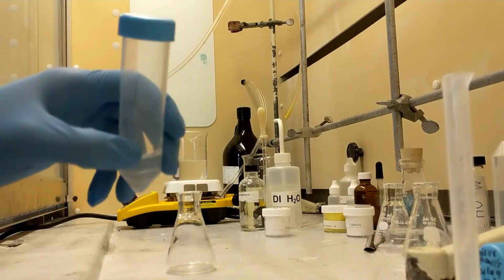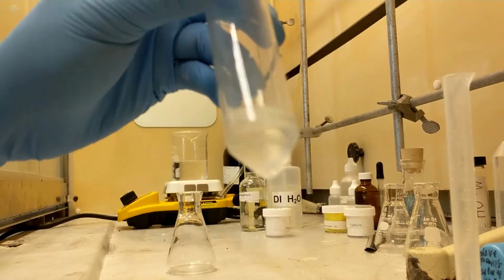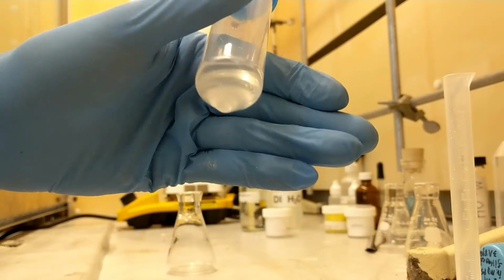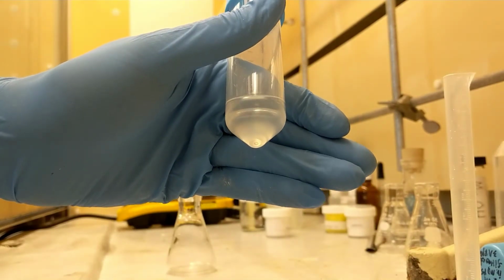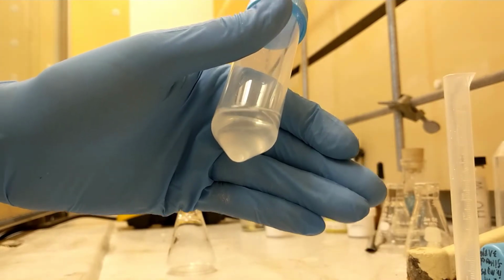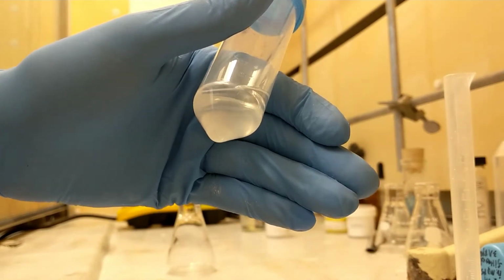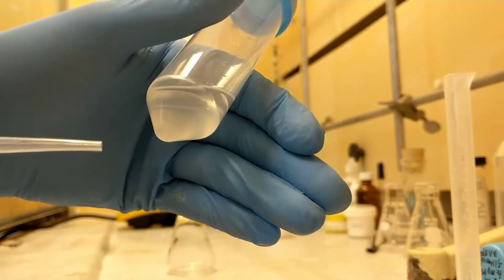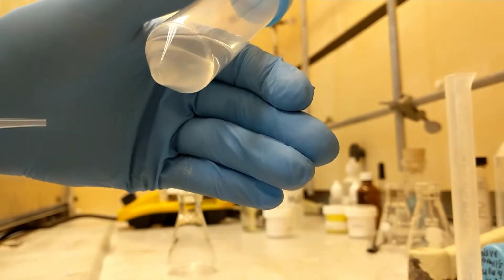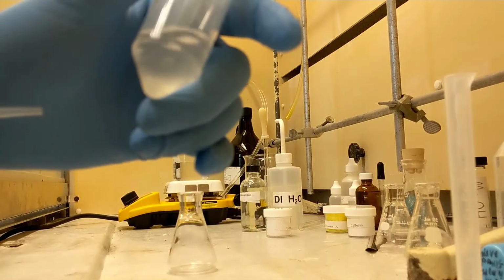Alright, we're back to experiment 3B. As you can see, I've dissolved all the succinic acid into this suspension of both water and methylene chloride. This up here is water, that's methylene chloride. It looks as if it all went into methylene chloride, which is expected since succinic acid, maybe. I won't speculate just yet.